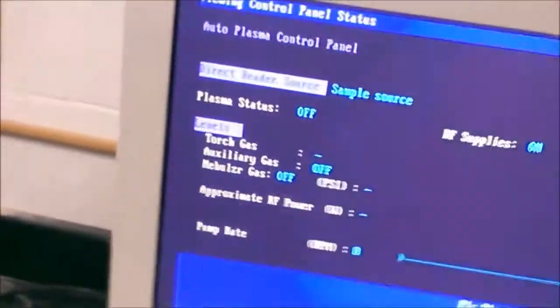So if you look here, you can see this is the computer. A lot of times you'll find it off like this. All you have to do — see that button down there? You turn that on, and now you have the computer. This will always be on. So in general, if the computer's off, you just press this button down here and you can actually turn the computer on.